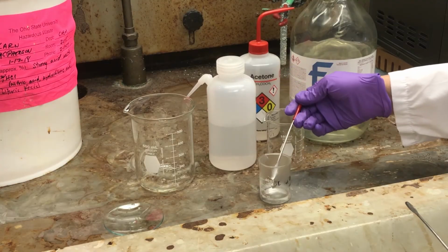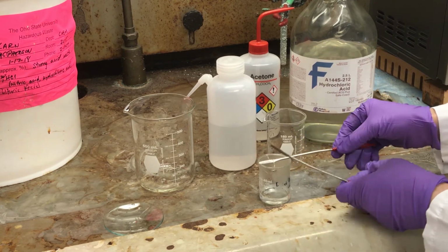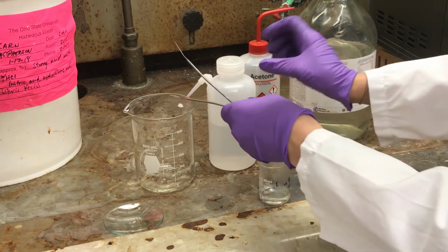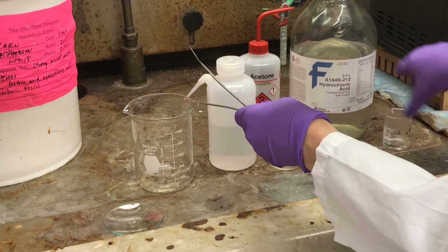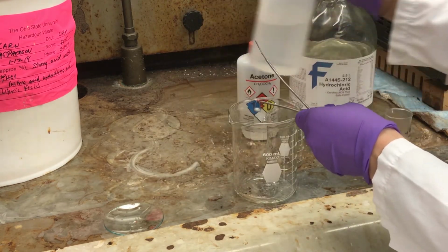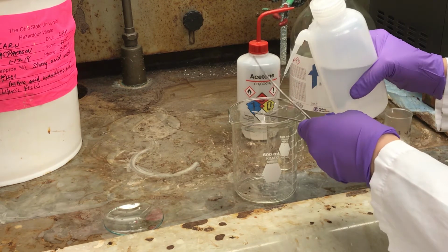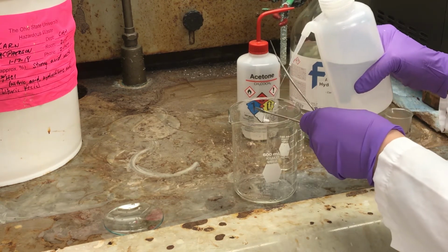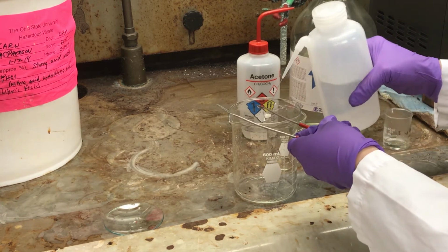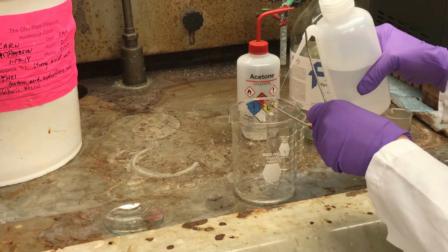Okay, so let's remove the platinum pan from the acid in the beaker. I'm just going to carefully put the pan on the spatula. Be very careful not to deform the handle on that pan. It's also very easy to do. And so I'm going to rinse this pan with water. Again, being careful not to touch it. Lots of water.